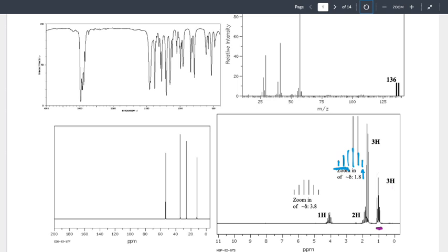Do I have 2 more CH2s? I do not, which means I'm wrong. Well, dang, is Doobie right? Doobie said I've got a CH2, yes, that's bonded to a CH3 and a CH. Do you have a CH3 and a CH? Okay, so your breakdown is internally consistent where mine failed. Make sense?